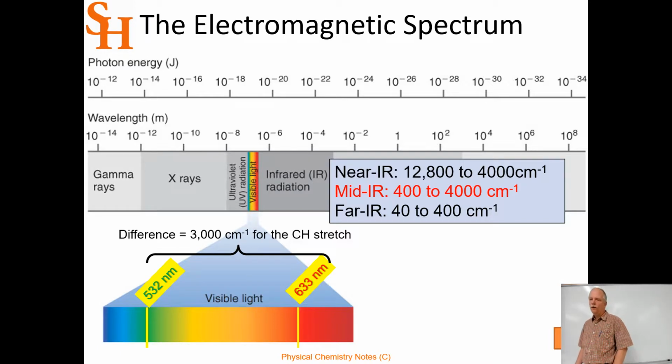So we have several lasers that are at our disposal. We have like a 633 nanometer laser. That would be like a helium neon laser, pretty common. 785 is a real common diode laser. We have a neodymium YAG laser, Nd:YAG, which is a neodymium atom inside a crystal of yttrium and aluminum. So yttrium and aluminum crystal, they're oxides in a garnet crystal structure. So yttrium, aluminum, garnet, that's YAG.